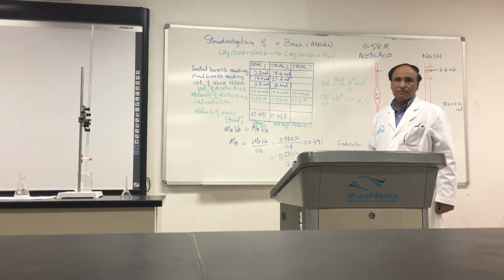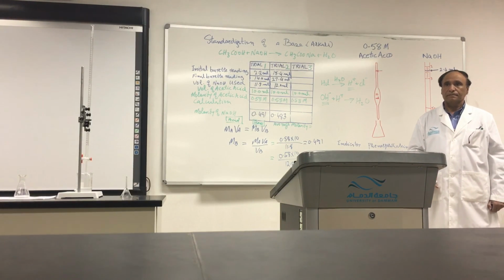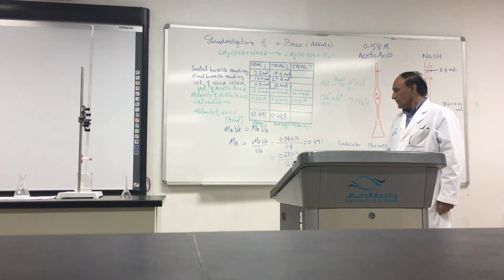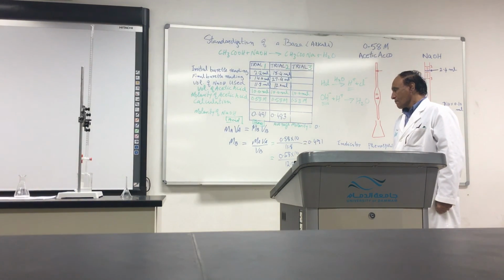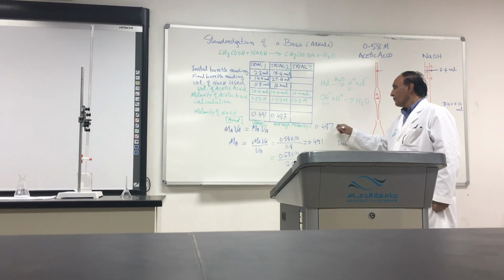Add both of them, divide by 2. 0.487 molar.